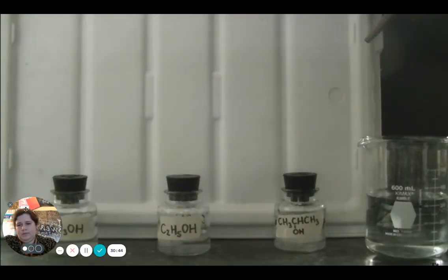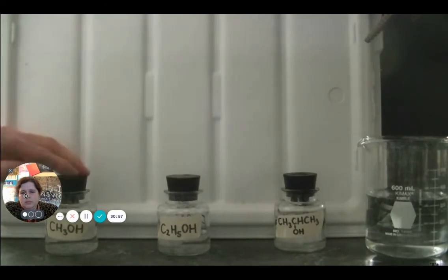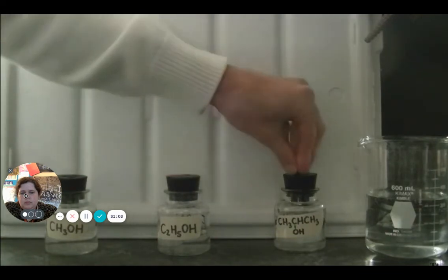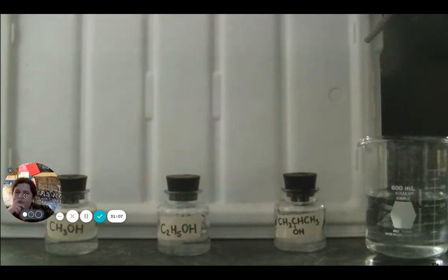I'd like to demonstrate for you the effect of increasing numbers of carbon on the combustion of alcohols. So I have 3 alcohols here with increasing number of carbons. I have methanol, a 1-carbon alcohol, ethanol, a 2-carbon alcohol, and isopropanol, a 3-carbon alcohol. We're going to combust all 3 of these and observe the similarities and differences upon their combustion.